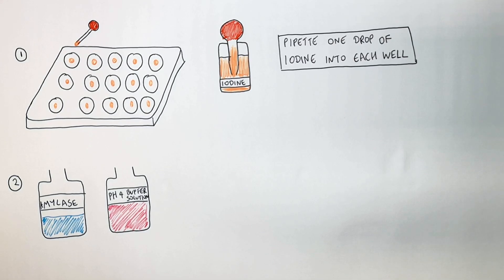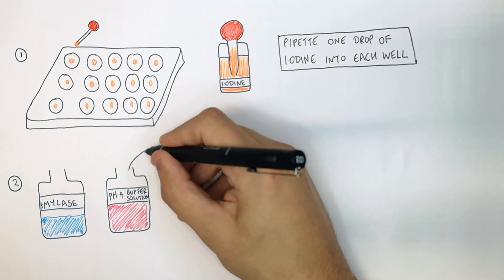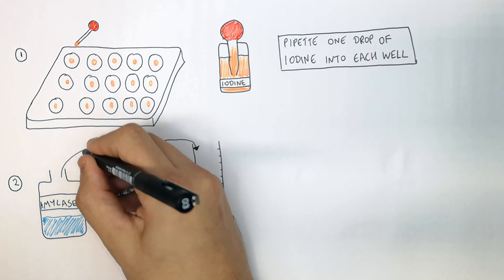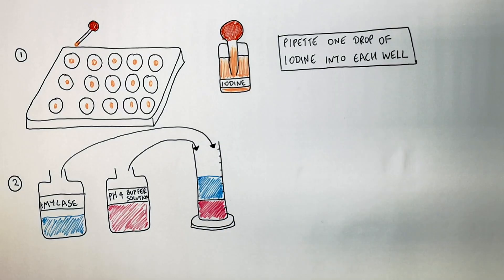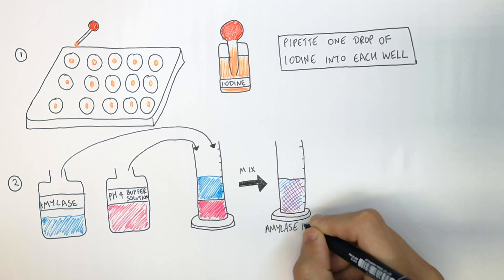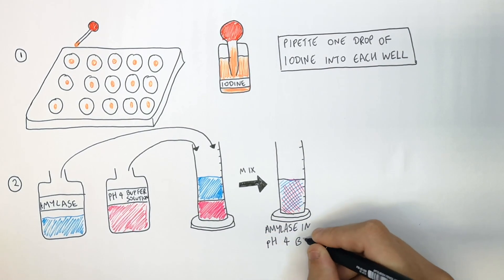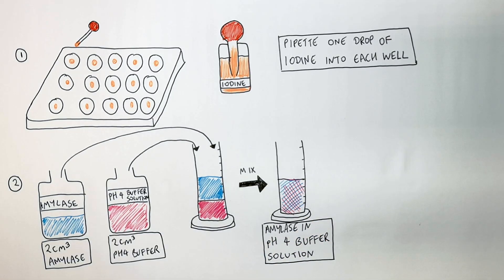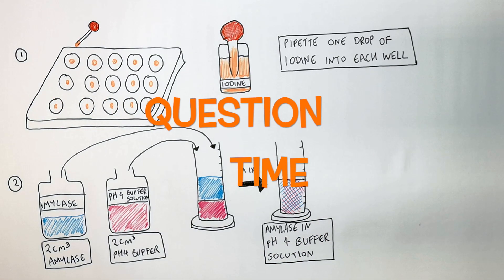Now we prepare our amylase solution at different pH values. In this scenario it's going to be pH4, so you add two centimeters cubed of the buffer solution and two centimeters cubed of the amylase solution into a measuring cylinder. Mix that solution together — you now have amylase enzyme in a pH4 buffer solution.